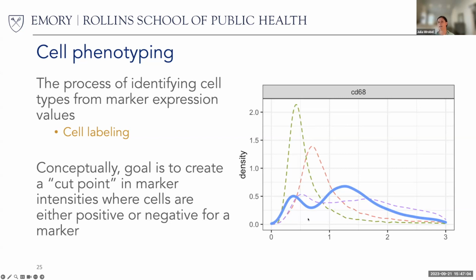So you might have more cells that are positive, that have higher values, in an image that has more of the cell type, but you would still hope to see that the distributions themselves were fairly similar. Because if you imagine this blue line was shifted to the right like 3 units, then it would be hard to tell from the blue line versus the red line where positive is, if you wanted to make a designation of what positive should be across the different cells.